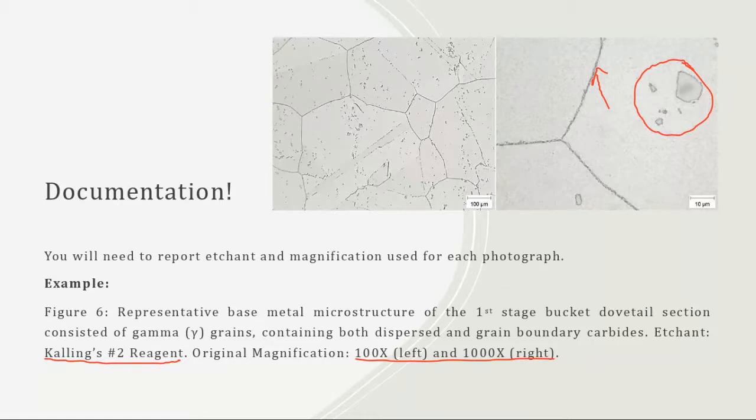So that'll conclude it for the microscopy aspect of it. The microscopes that we have in the labs, I believe, are all equipped with polarizing and DIC illumination, and obviously they all have bright field.